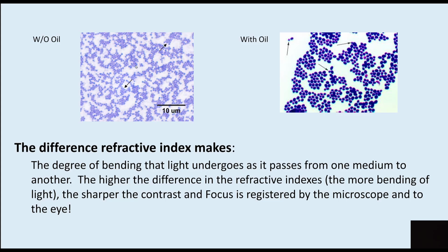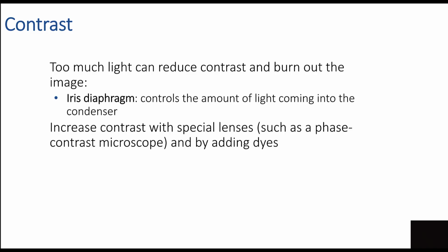And we see this again, if it's a little bit blurry, it looks like there's some sort of... you're going to see this, and this is staph, and with oil, boom, man, it pops, and that's what we want you to see. And again, there's a difference between without and with oil, so please make sure that we use that.